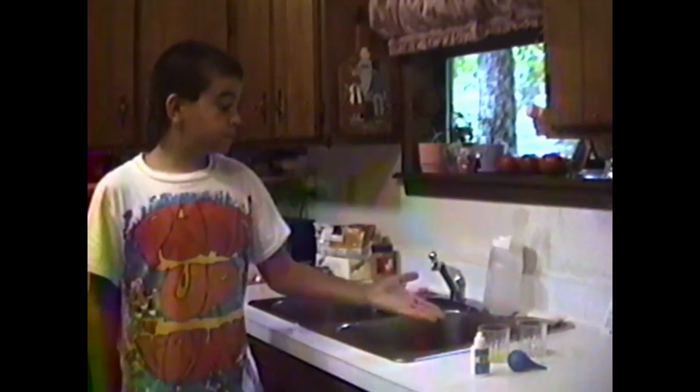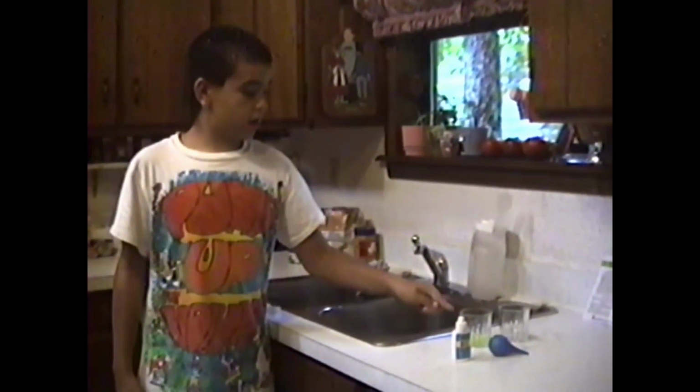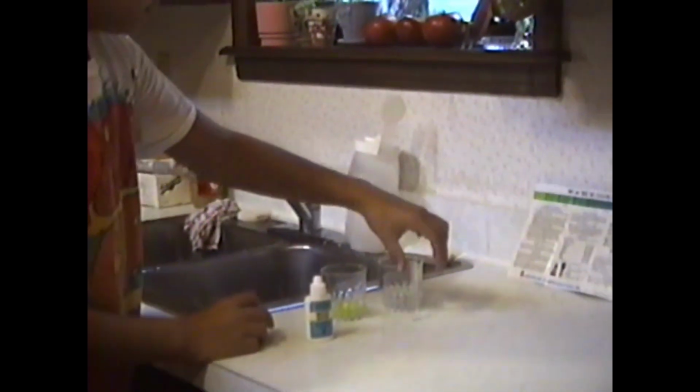I'm here to prove today if vinegar or ammonia is acid or alkaline base. I will take this solution and figure out whether vinegar or ammonia is acid or alkaline based.